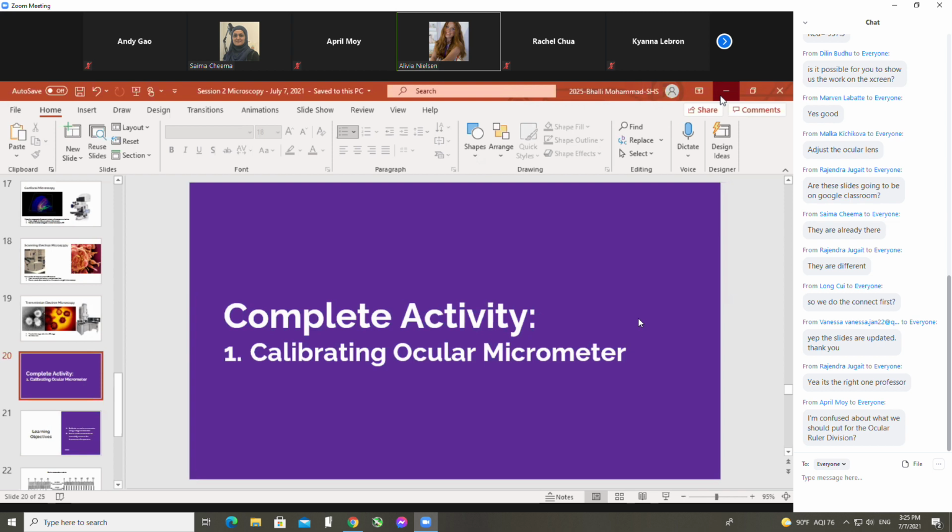Did the kit come with the Petri dishes? Yeah. Okay, perfect. I was just wondering where we should put the melted agar, but if it comes with it, it's good. Absolutely. Just make sure when you take the test tube out of the water that it's not dripping, so you don't end up pouring that water into your agar, because it will get contaminated and you will have growth there when you shouldn't. Be very careful with anything that is outside of what's inside the test tube.